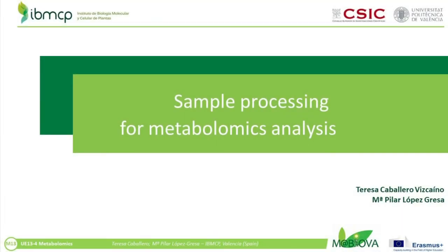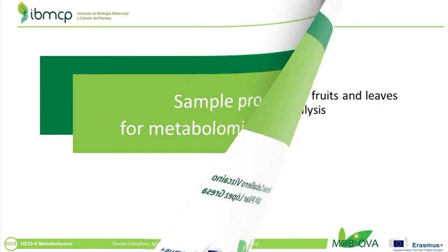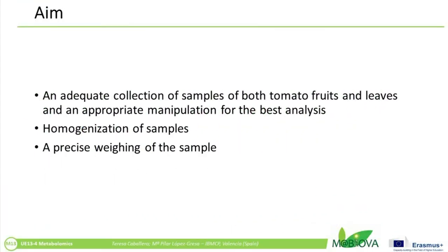Sample Collection and Homogenization for Metabolomics Analysis. The main goal of this video is to show an appropriate way of both tomato fruit and leaf collection and their correct handling and homogenization for an optimum metabolomics analysis.